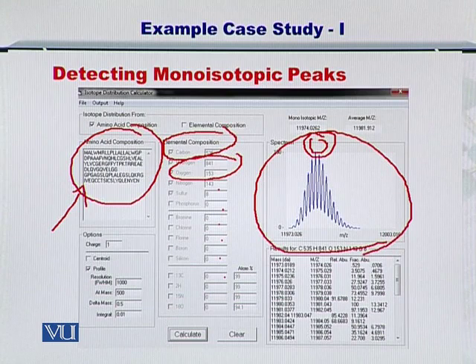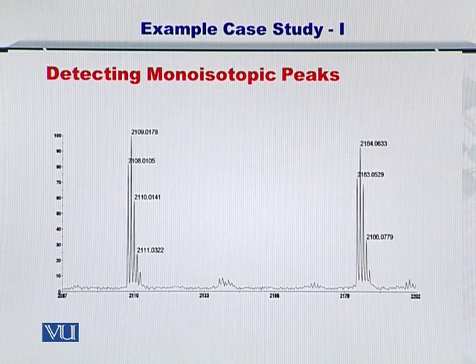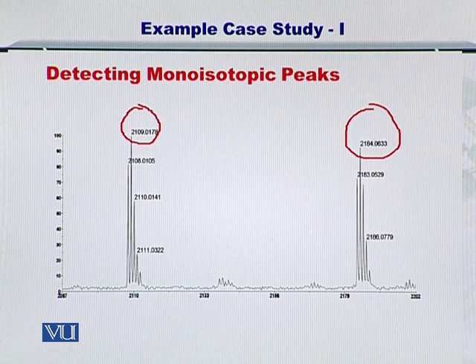It is necessary to talk about the monoisotopic mass because you cannot possibly compute or even utilize the other masses which do not include the monoisotopic mass. So we always work with the monoisotopic peak. As you can see, there are two experimental data sets here, and there are two monoisotopic peaks that can be observed as the highest peaks.